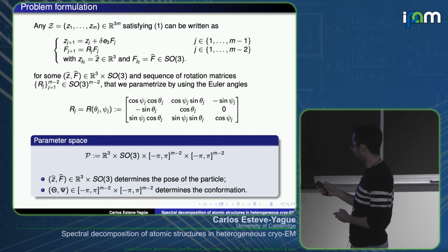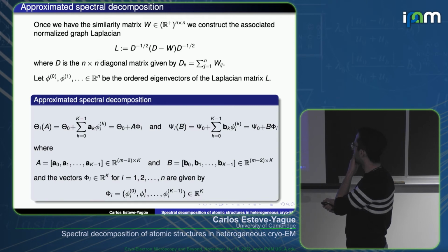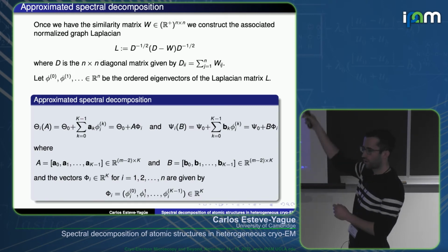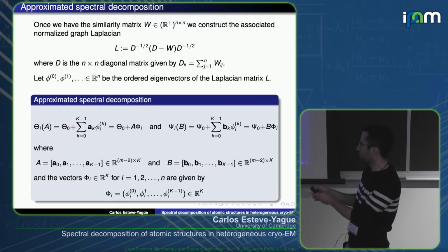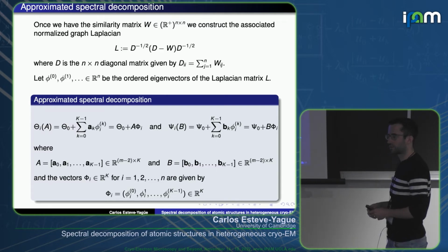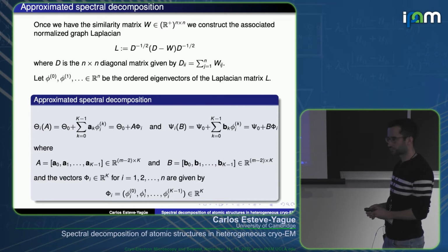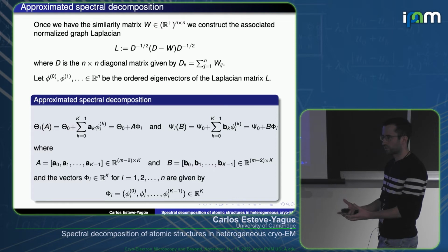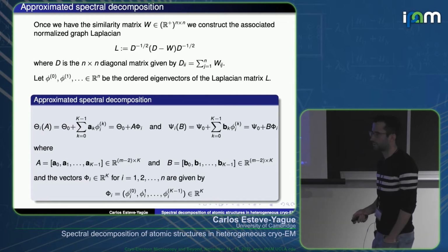So here, A_k are vectors of length the number of atoms. For the atoms, for instance, in a helix, that we know are going to be constant, you just take these parameters equal to 0, and then this part, in all the conformations, will be moved rigidly. So this is also information that you can use to decrease the number of parameters, and of course you end up with more constrained structures that you are exploring. So you have less flexibility, but the more information you have, the better.